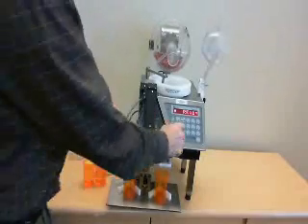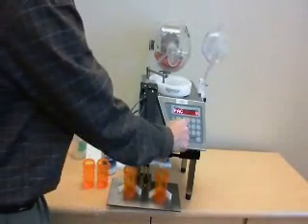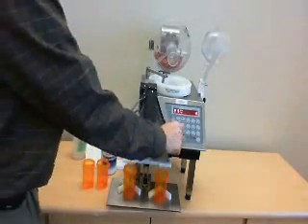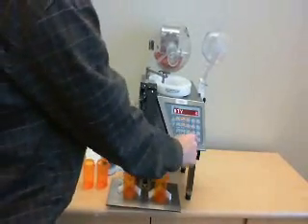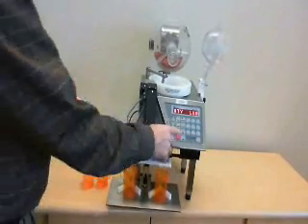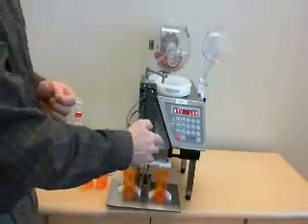Alright, we're going to set then the number of packs, which is going to be 4, or you can go up to thousands of them. And then the number of units, we'll go with bottles of 100. Again, you can go to up to thousands of this. And then we're going to hit start, and it's going to automatically count left side, then right side.